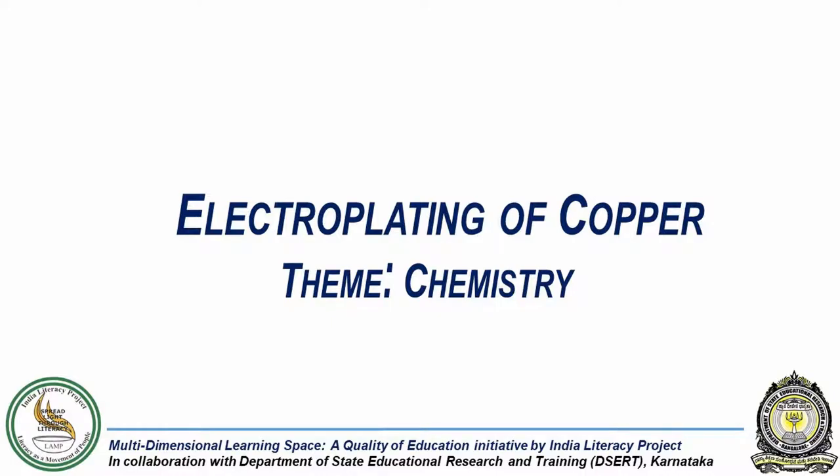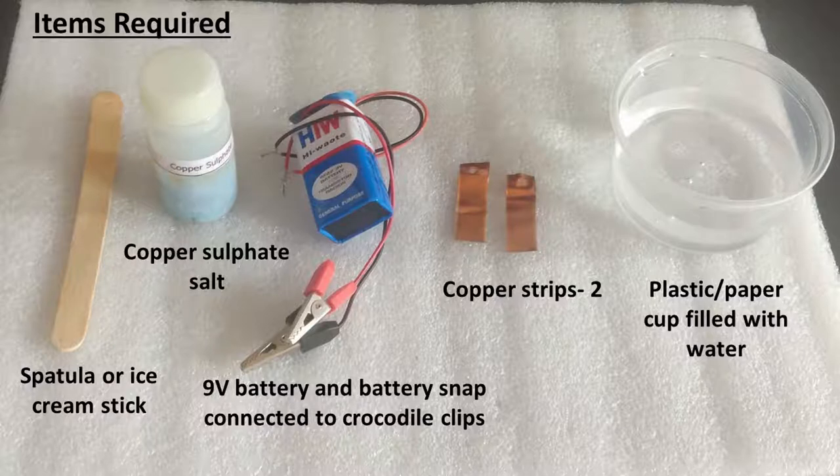In this experiment, we will coat a strip of copper with copper metal using the electroplating method. For this we will need a plastic or paper cup filled with water, copper sulphate salt, a spatula or an ice cream stick to mix the salt in water, two copper strips, and a 9 volt battery connected to a battery snap and crocodile clips.